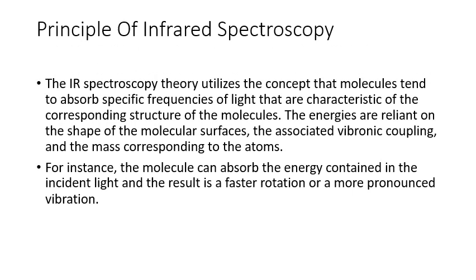Principle of infrared spectroscopy. The infrared spectroscopy theory utilizes the concept that molecules tend to absorb specific frequencies of light that are characteristic of the corresponding structure. This is the basic principle. A molecule will absorb only those frequencies which are useful for vibrations or rotations.